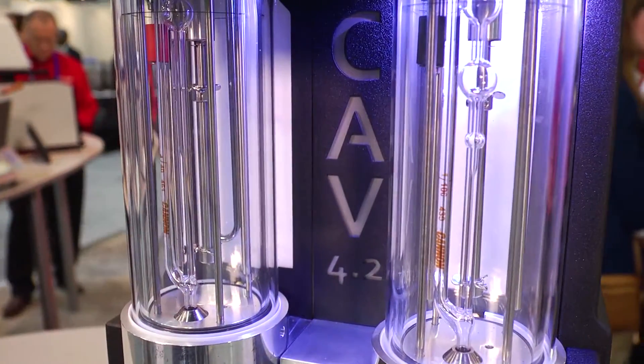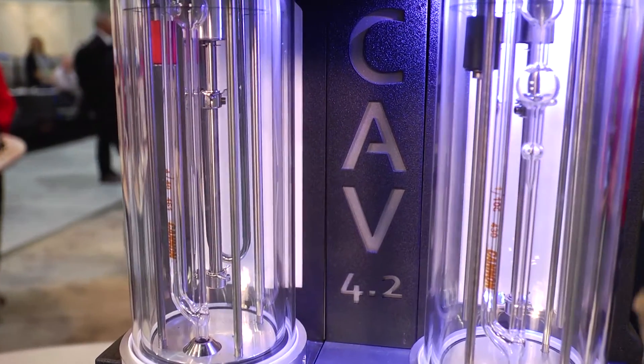Hi, I'm Steve Ernst, editor of LabCompare, and I'm talking with Pat Magai, president of Canon Instrument Company, about the CAV 4.2 automatic dual bath viscometer. Pat, this is an ASTM D445 instrument.